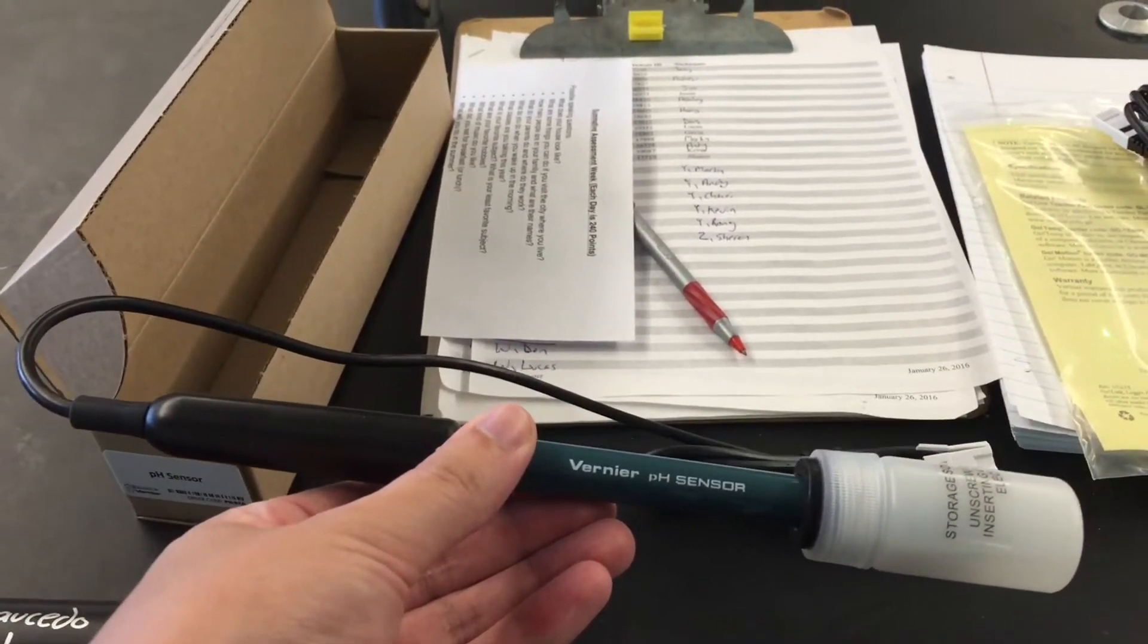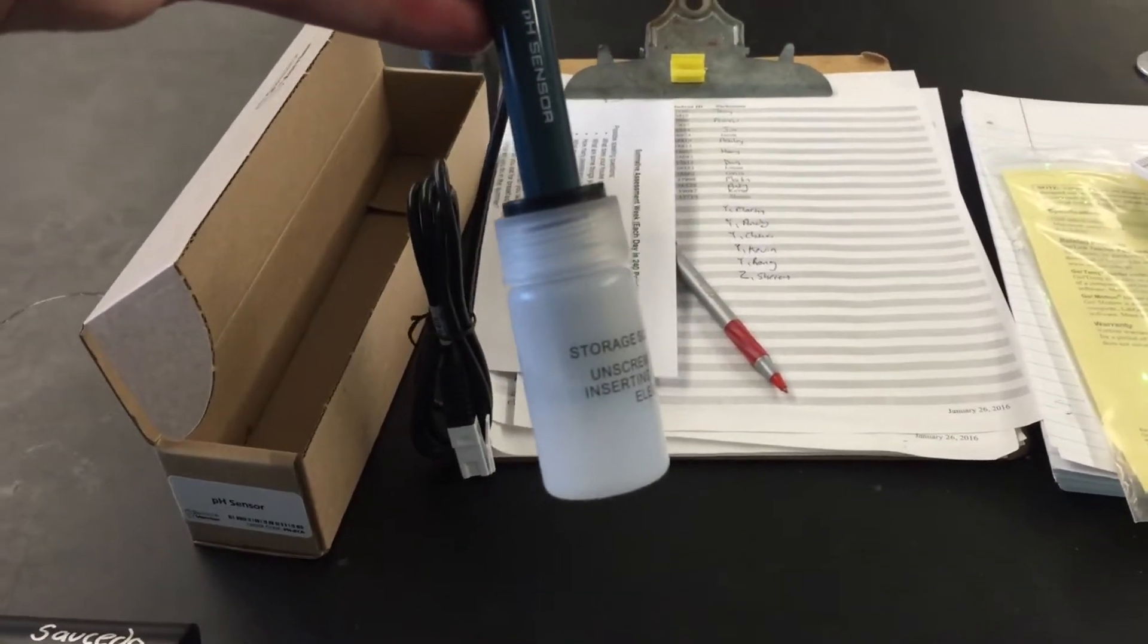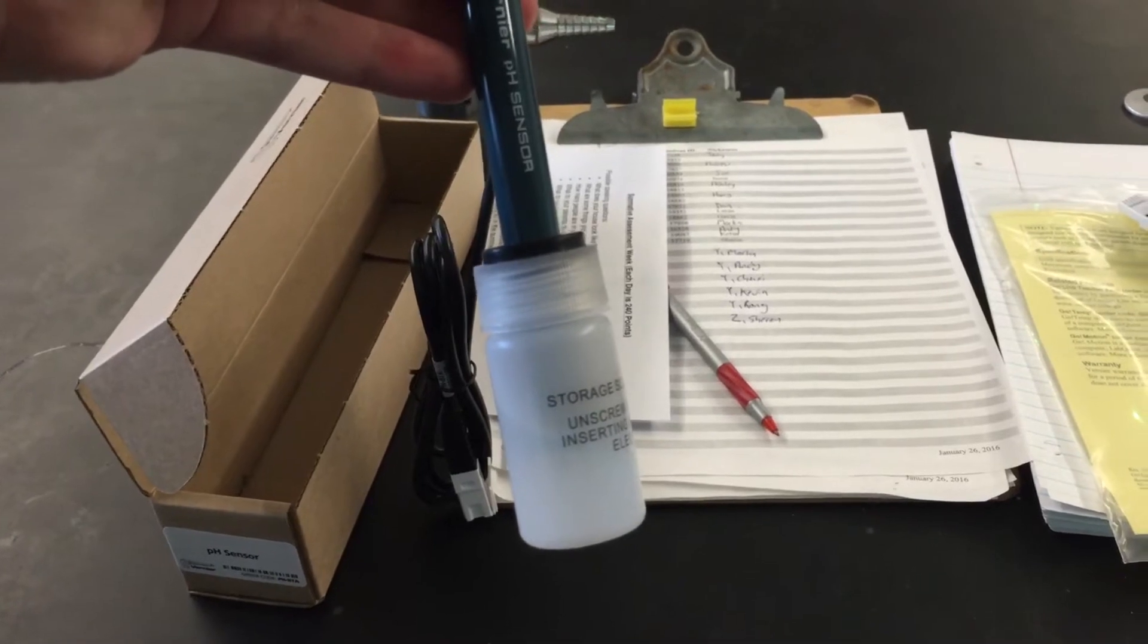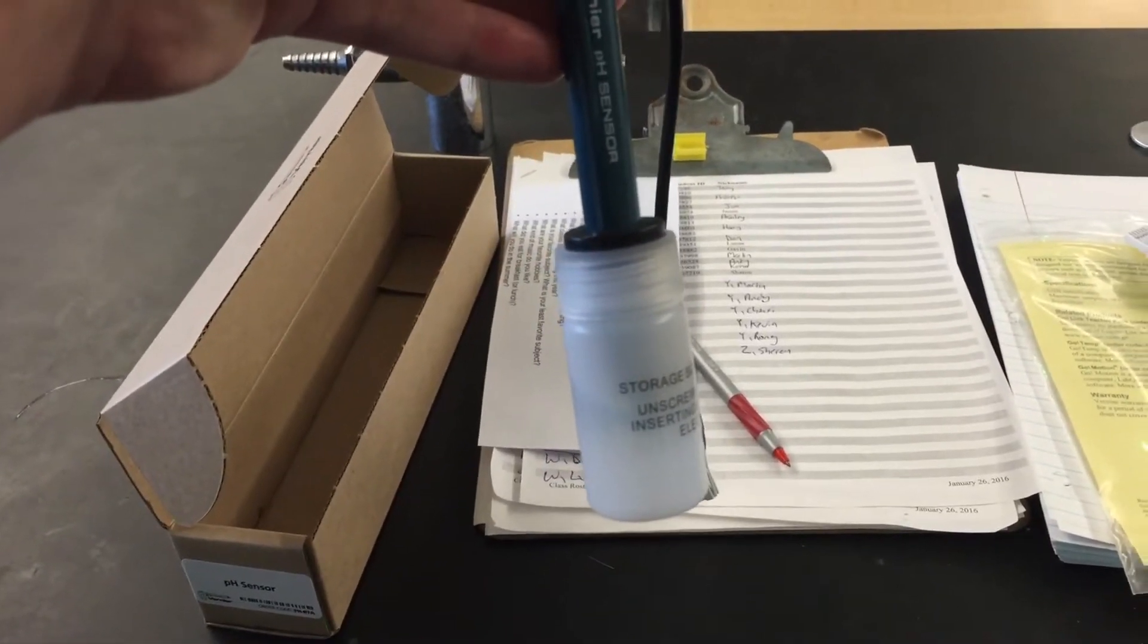One of the most important things to recognize is that you have this weird little container of fluid here connected to the pH electrode. You need to unscrew this before you do any analysis.